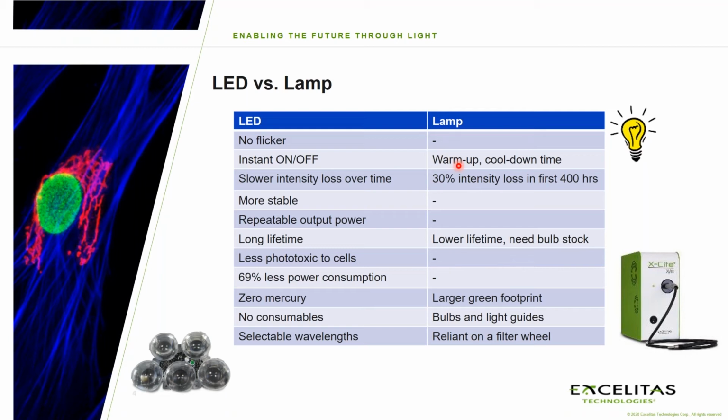I remember using a HBO lamp at my advisor's office, and she said, make sure you turn it on, wait for about half an hour, and then do not turn it off or the thing will blow up. And she basically scared the life out of me. So I was scared of that lamp. LEDs are simple on and off. Push a button, electricity flows through, light comes out. Push a button, it stops, and light stops coming out.